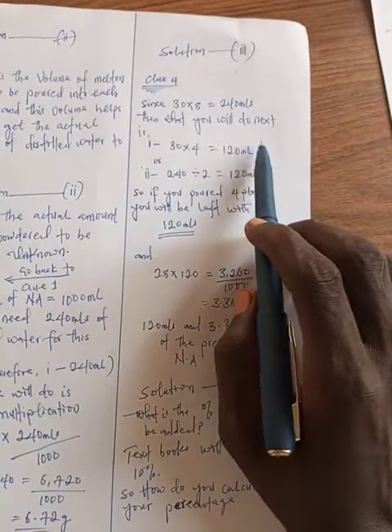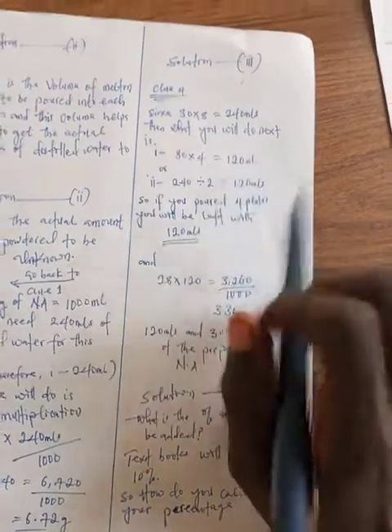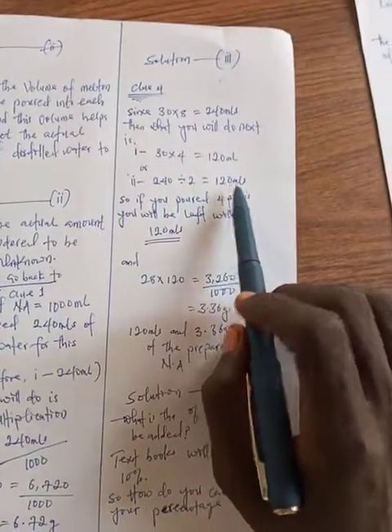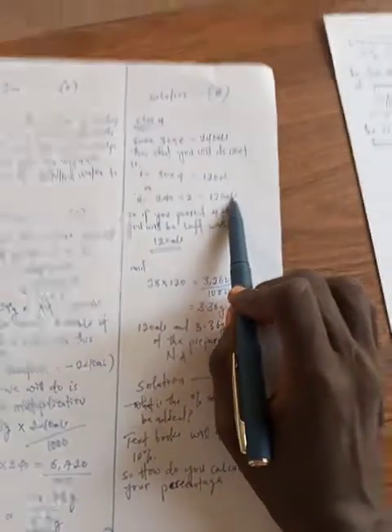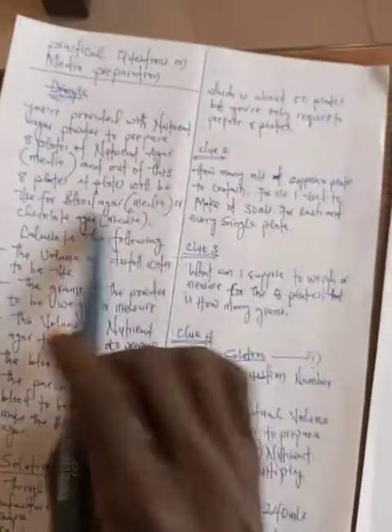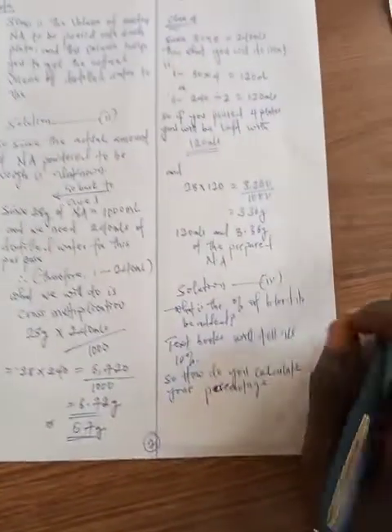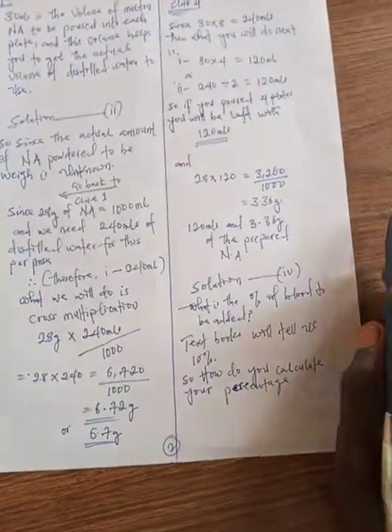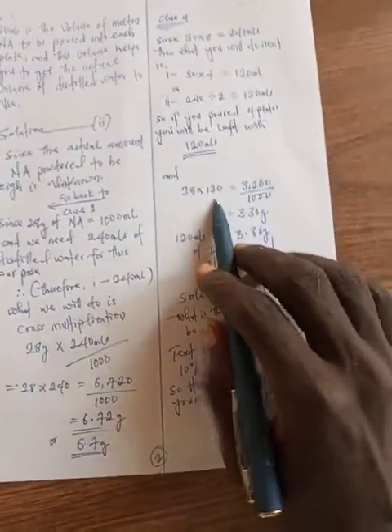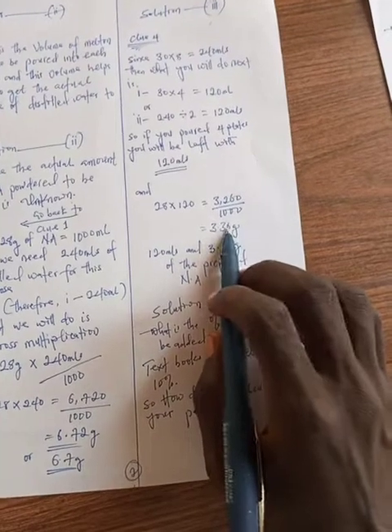That is to say that if you pour 4 plates, the remnant left is 120. Or you will say 240 divided by 2 will give you 120 mils. So 120 mils now is remaining for you to prepare your blood agar, or your chocolate agar, if we are working together. Now, so simple. The next thing now is 28 times 120 will give you 3,360. You divide it by 1,000, you get 3.36 grams.